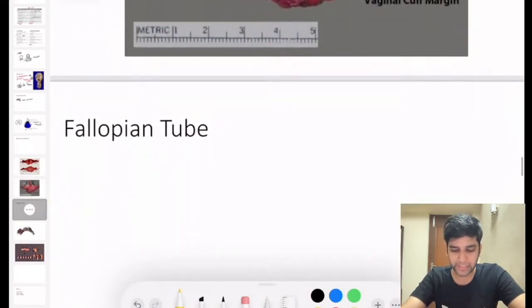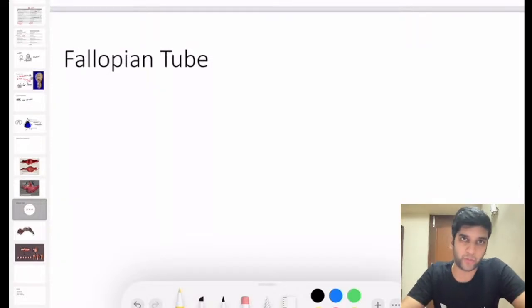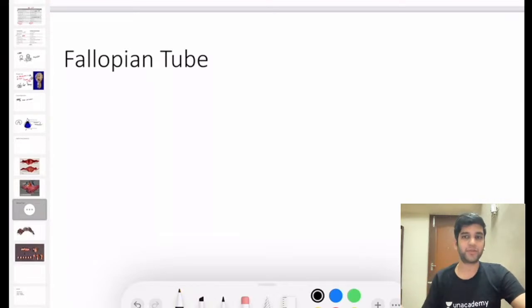Okay, that's with the cervix. I'll go to the fallopian tube. I'm sure you must have crossed fallopian tubes, right? Because tubectomy is one of the commonest things which comes to your lab. What do you do for a fallopian tube? We don't generally do anything, right? We take a tube, cut it into pieces, and throw it away. We just say that lumen is present. It'll be 2 pieces, and you directly give it to your technician to embed and cut, right?